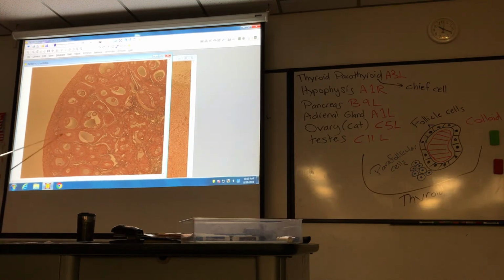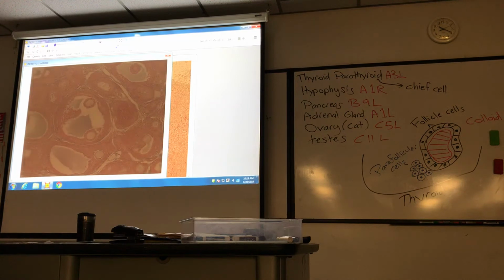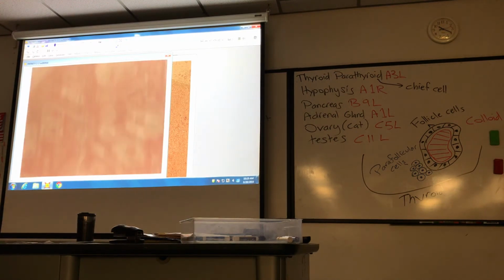Let me see if I can get this into a higher mag. Let's go from low. This is a 40x. This is 100x. Go to the edge.